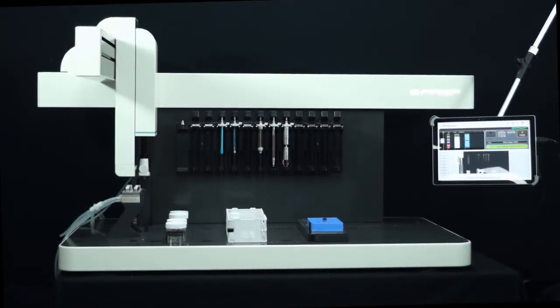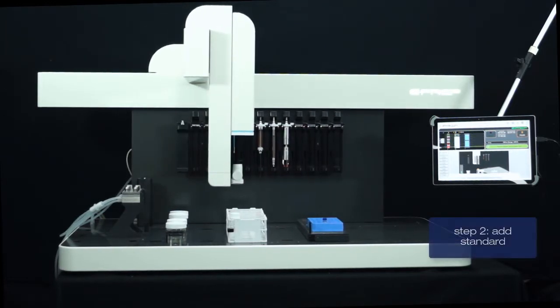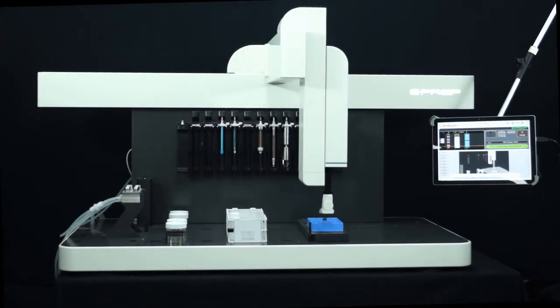The next step is the syringe moves to a 200 ppm standard container, withdraws 100 microliters of solution, and dispenses this into the same 2 ml vial.